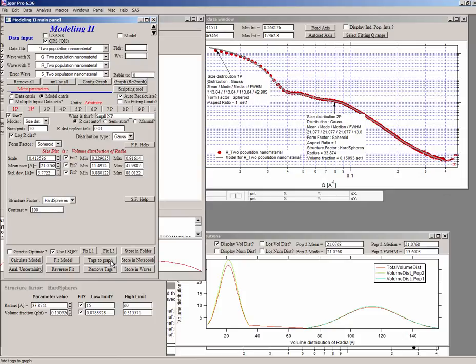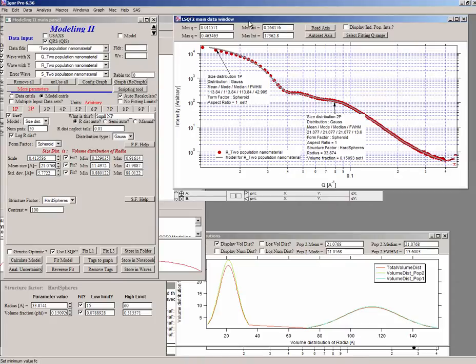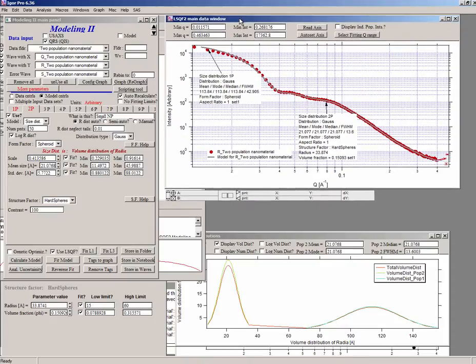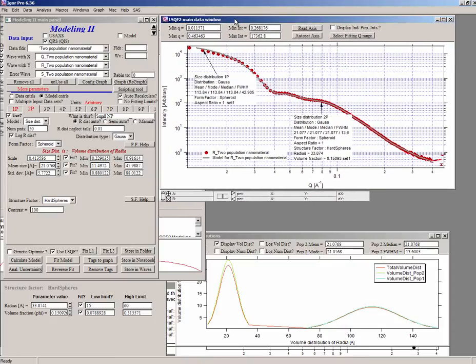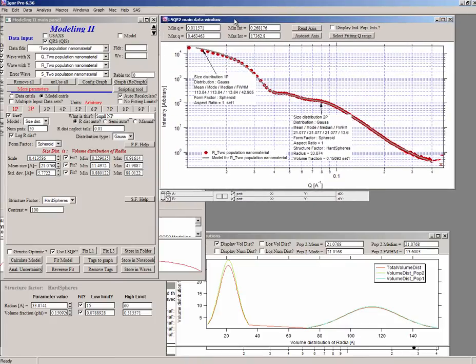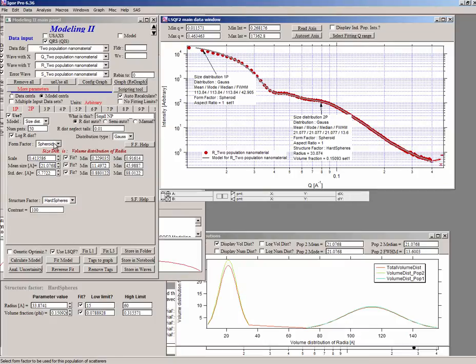But anyway, I hope I have shown you that if the data have enough information and you know at least something about them, in this case we could hopefully trust the fact that we can use spheres because we are using spheroid with aspect ratio one as a form factor. So we can use spheres as a model. Hopefully that's close enough to the real materials.